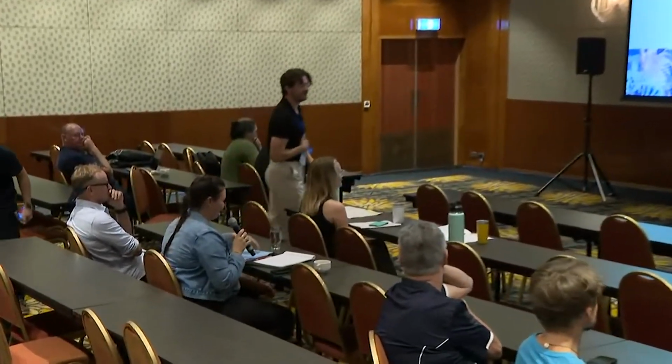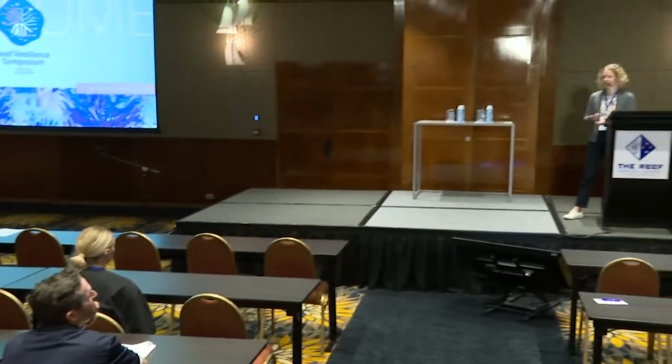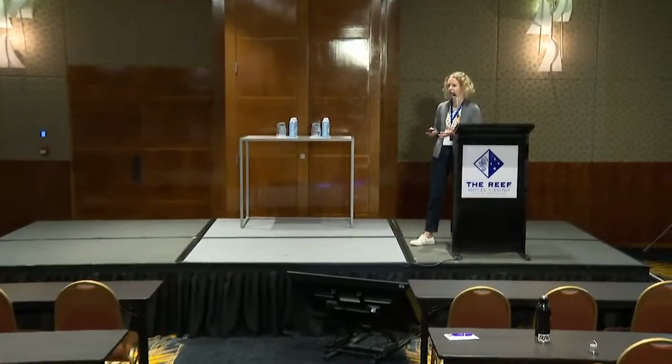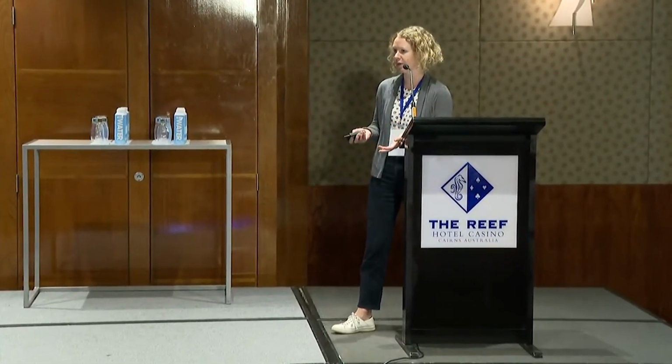Just a quickie, Christine. If I brought you some coral samples, how long would it take start to finish to get that analysis done on the boat? I probably should have mentioned that earlier when I say high throughput and rapid, what that really means. With the MTP device, we can measure about 4 genotypes or 4 colonies of corals in about 40 minutes.